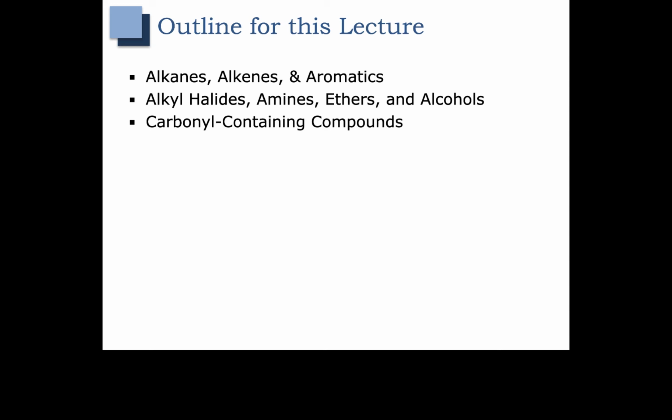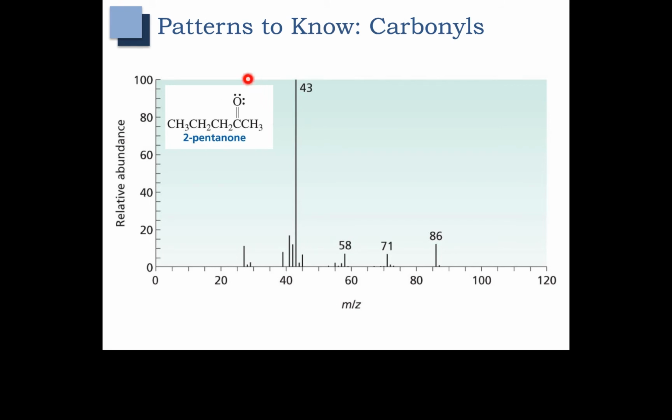In this lecture, we're going to talk about mass spectrometry fragmentation patterns of carbonyl-containing compounds. Here we have 2-pentanone. 2-pentanone has a molecular ion of 86, but we also see peaks here at 71, 58, and we see a significant base peak at 43. So we want to figure out what's going on with those.